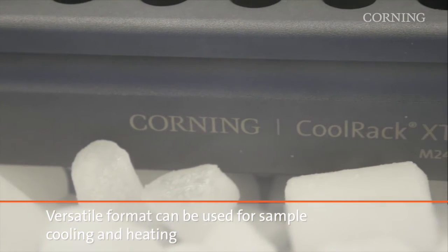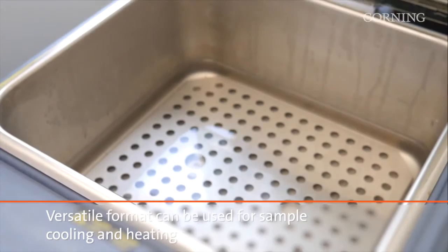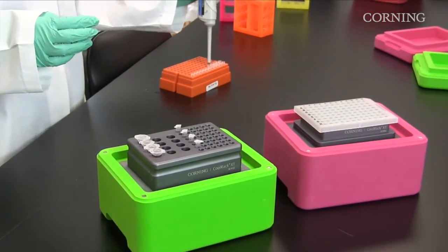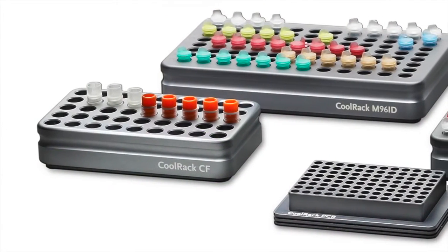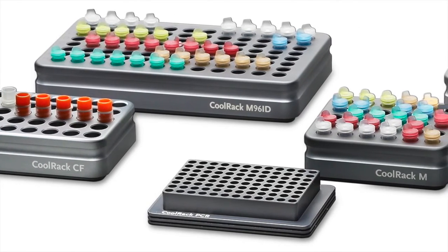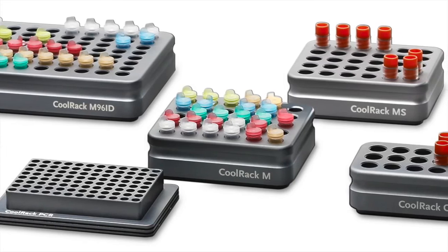The Corning CoolRack and thermal tray modules are versatile and can be used on dry ice, liquid nitrogen, or on heat sources such as water baths, incubators, ovens, and hot plates. There are a variety of Corning CoolRack modules that accommodate most common lab tools, including micro centrifuge tubes, cryogenic vials, PCR tubes, strip tubes, microplates, 15 or 50 ml tubes, flat bottom and round bottom microplates, and 2D barcoded tubes.